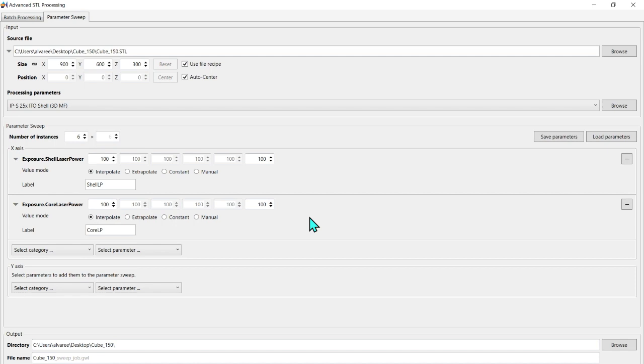So, but now we are doing the parameter sweep as a test run to find the best conditions. So we are not going to leave the same value. What we are going to do is to modify. To modify these values, we have 1, 2, 3 options because constant is just constant value.